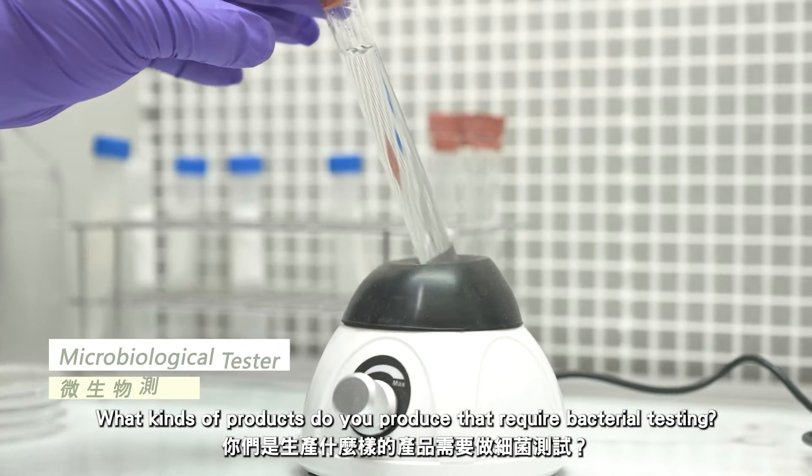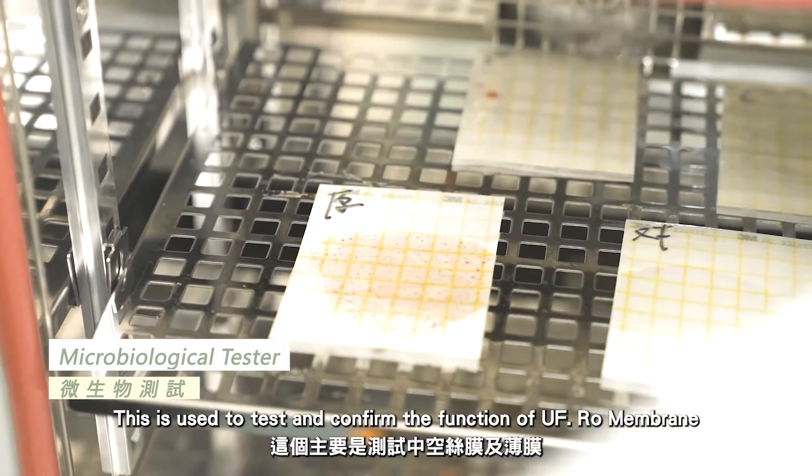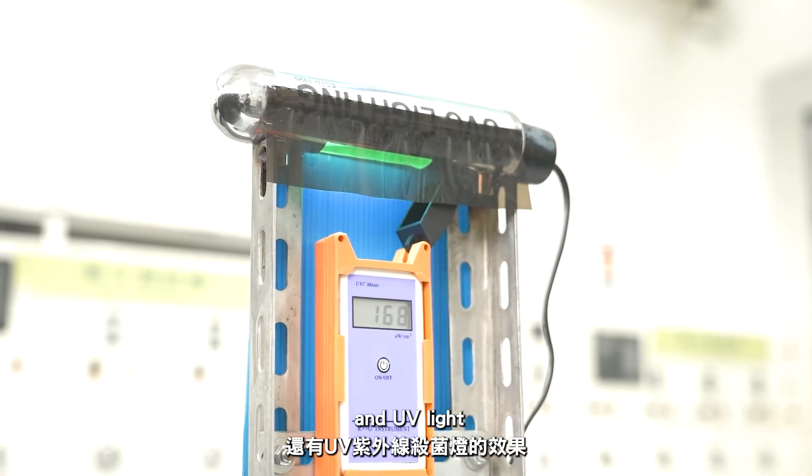What kind of products do you produce that require bacterial testing? This is used to test and confirm the function of UF membrane and UV light.